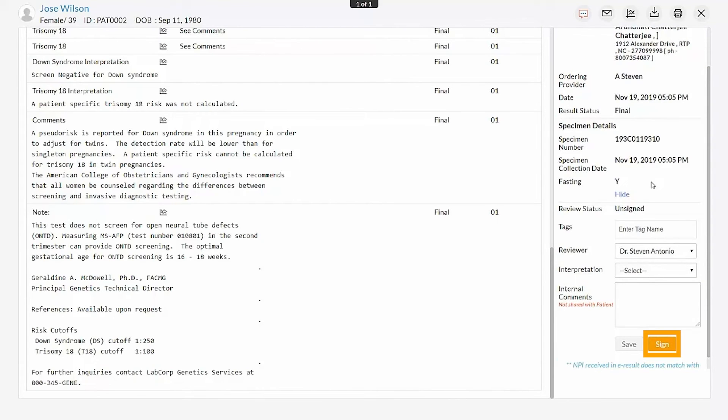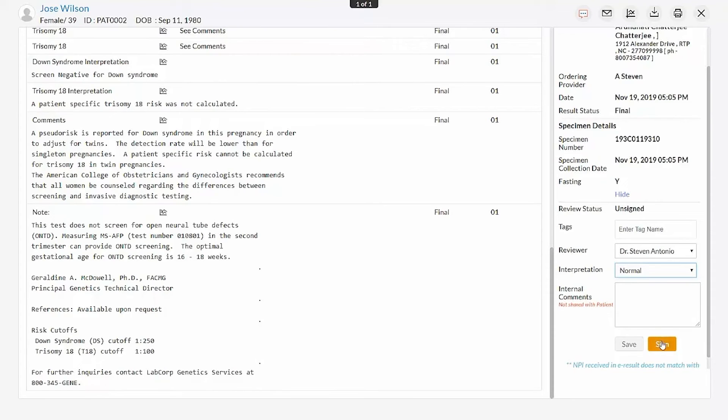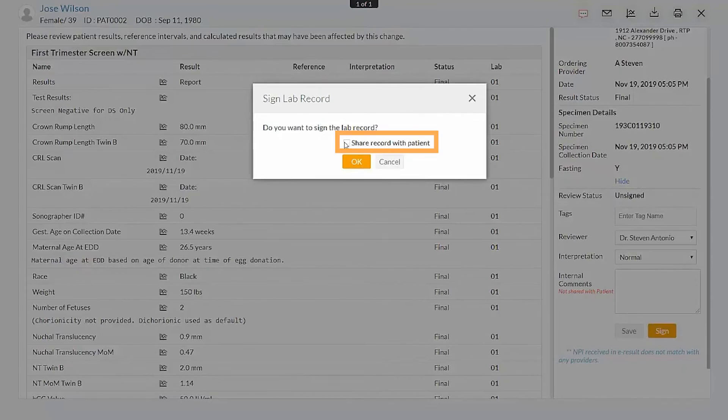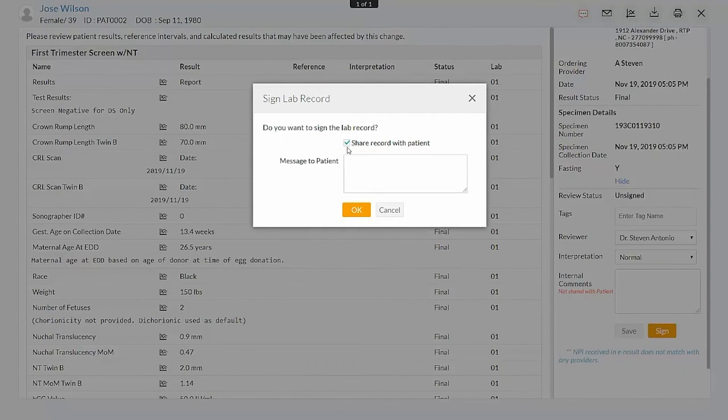If the patient already has a Charm Health PHR account, you can share the results with them by clicking the Share Record with Patient. You can also send an internal message to the patient if required.